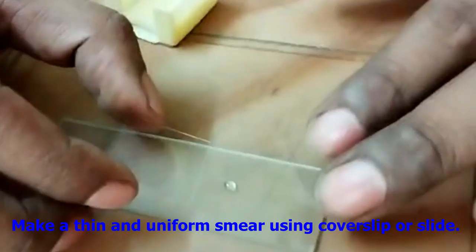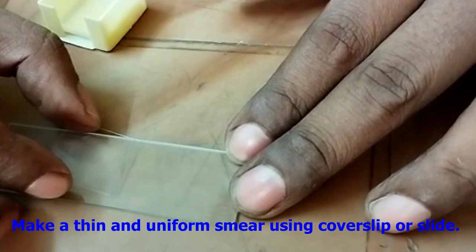Now make a thin and uniform smear using a coverslip or slide, whichever you feel comfortable with. Just ensure the smear must be uniform and thin enough. Let the smear be air-dried.